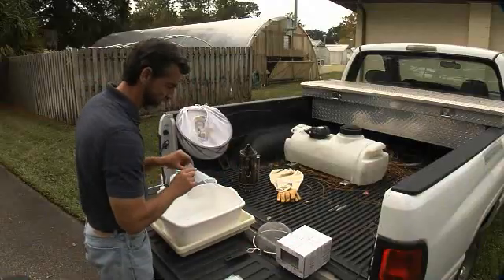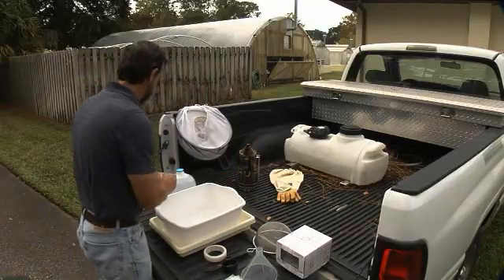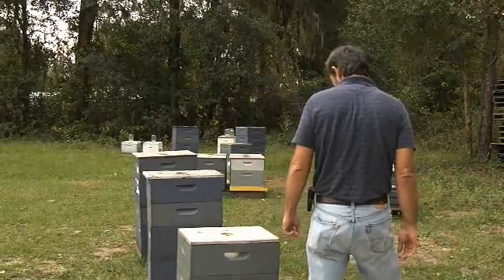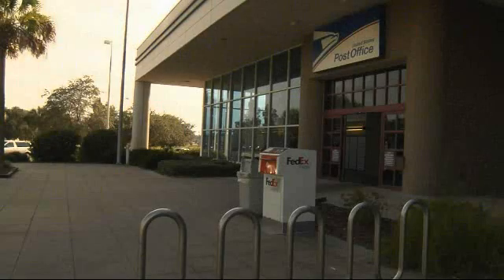Before leaving for the apiary, ensure you have all of the necessary equipment including beekeeping protective gear and beekeeping tools. It is also important to remember to fill the one-gallon bottle and the wash bottle with water. Identify an apiary with at least eight colonies of bees, and also identify the nearest post office to this apiary.